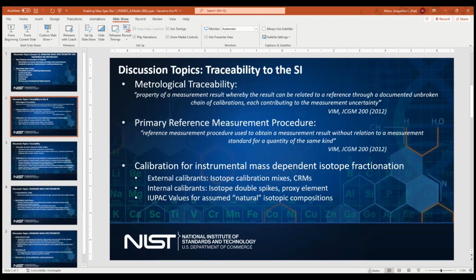Thank you, Zoltan. Before I move the mic to Mike, Mark Tyra has put a comment in the chat about isotope dilution mass spec. You are using gravimetric measurements for your reference materials and for mixing reference materials and samples, but measuring ratios. So there are, in effect, two items, not just like and like. I think this is part of the argument that IDMS is a primary method. And with that, Michael Winchester and then Robert.